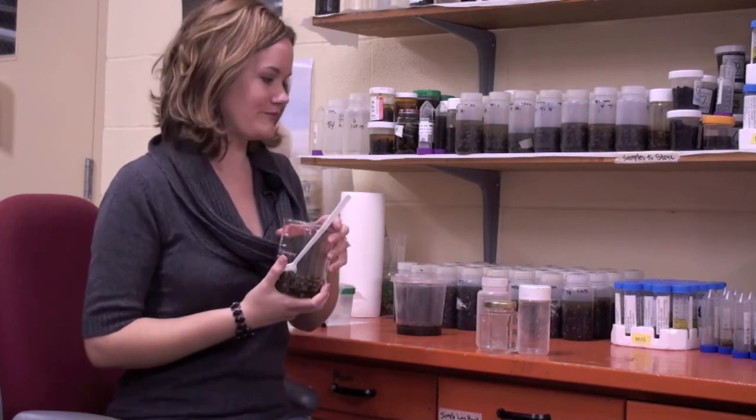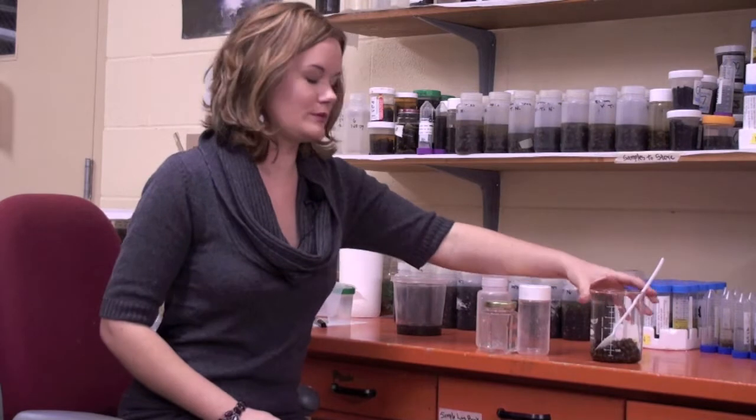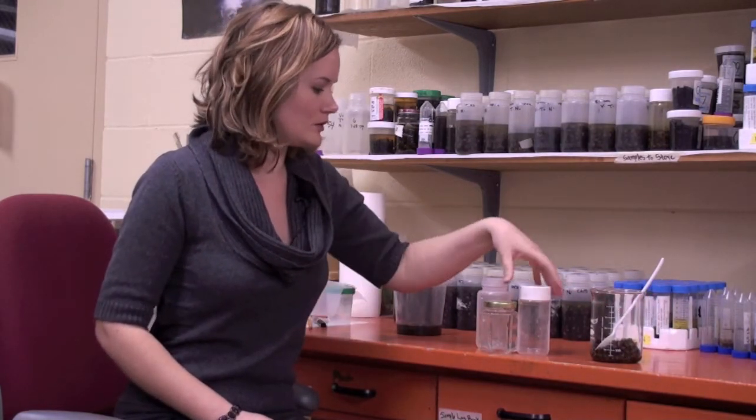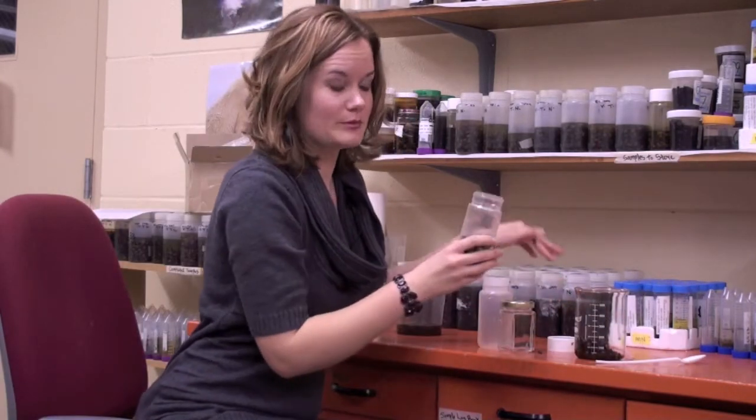And so when you go out and sample in the field, and you get bees, so I've skipped to the point where you've already collected your bees, you're going to have dry, dead bees at this point. So you're going to be putting them into a container with alcohol. So we're going to use this container. I need about half a cup to a cup of bees.